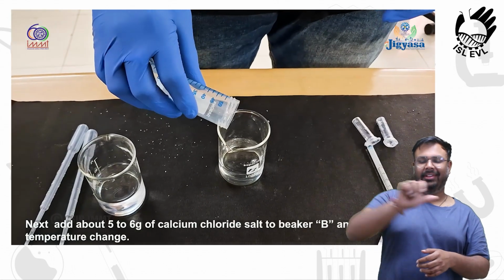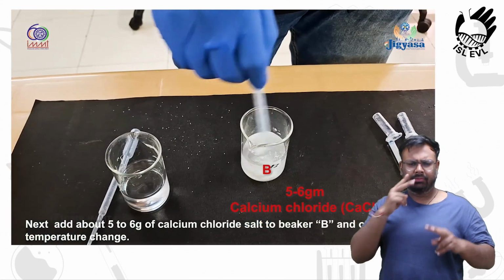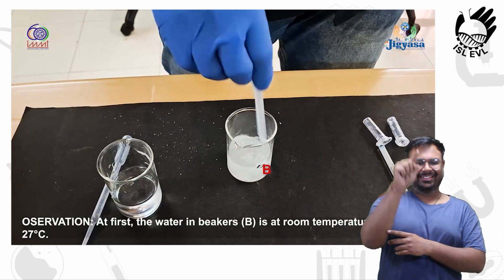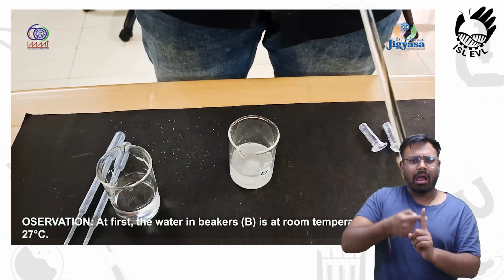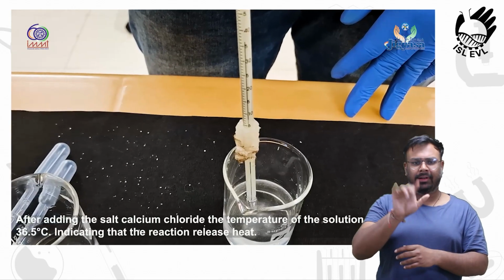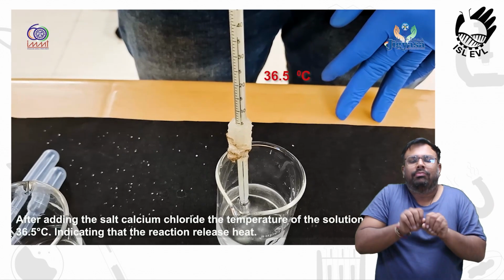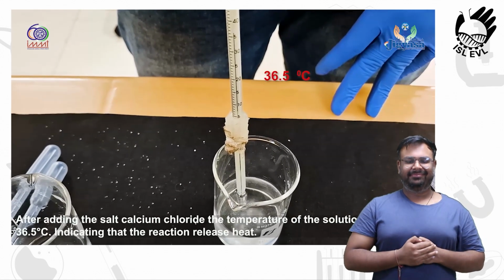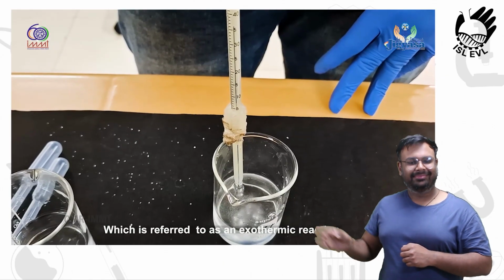Next, add about 5 to 6 grams of calcium chloride salt to beaker B and observe the temperature change. Observation: at first, the water in beaker B is at room temperature, which is 27 degrees Celsius. After adding the salt calcium chloride, the temperature of the solution increases to 36.5 degrees Celsius, indicating that the reaction releases heat, which is referred to as an exothermic reaction.